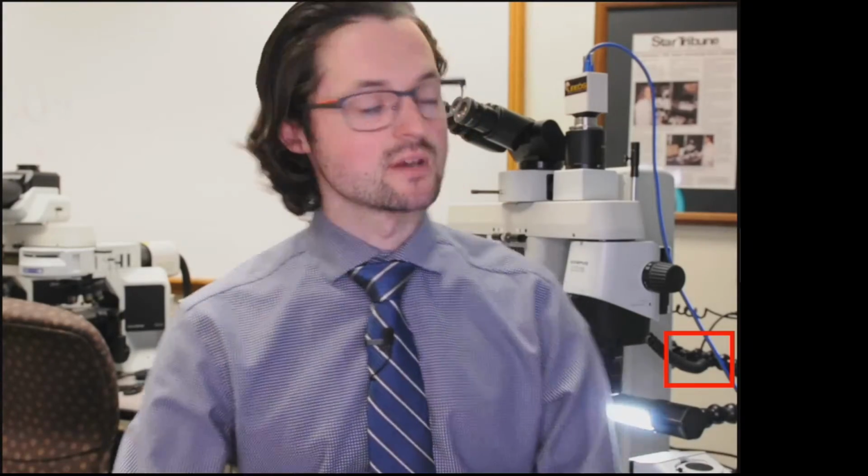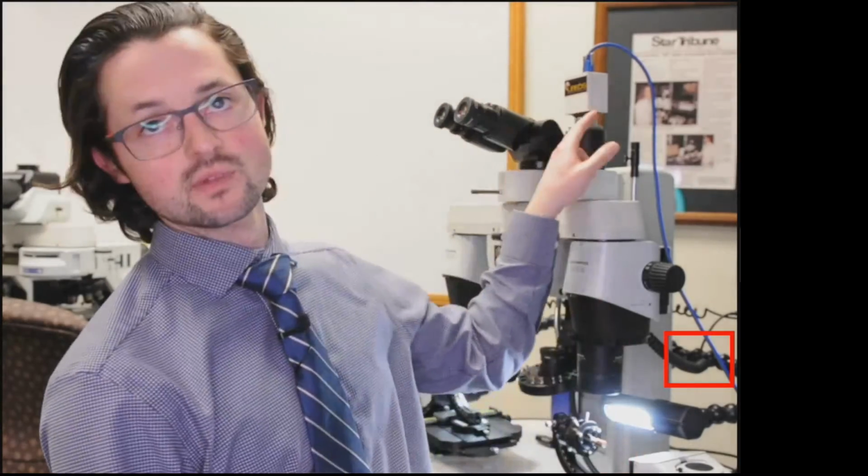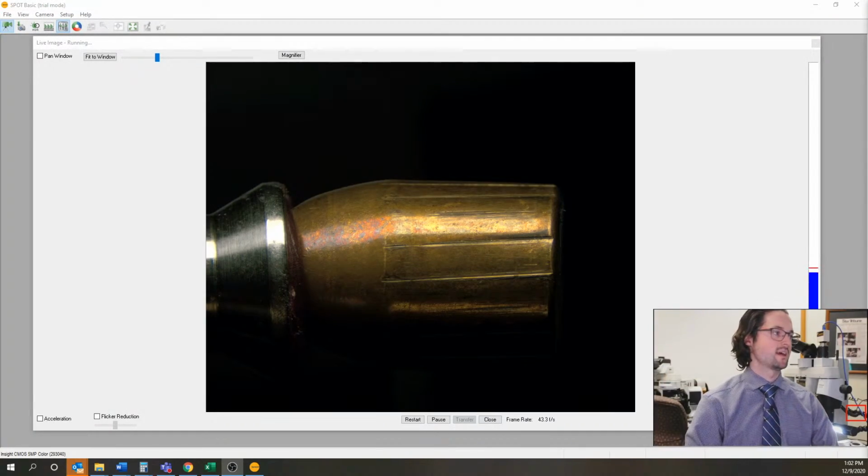And while I'm using one of our LCF3 comparison microscopes behind me, you can actually use what we're going to cover today on any of our Spot software-driven cameras. So that's like the CMOS 5, and that's also for our trace comparison scopes too. So you should be seeing the software, and yes you are.